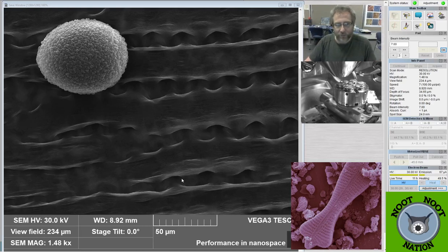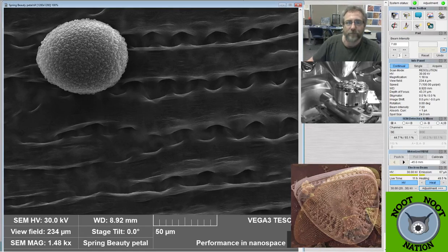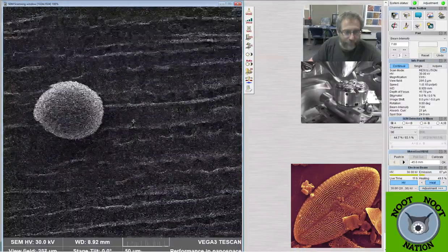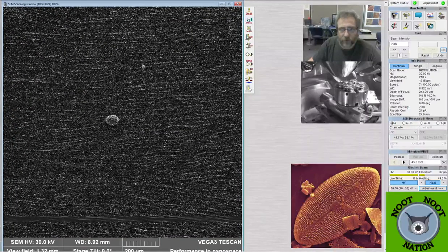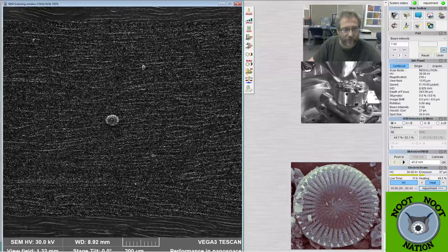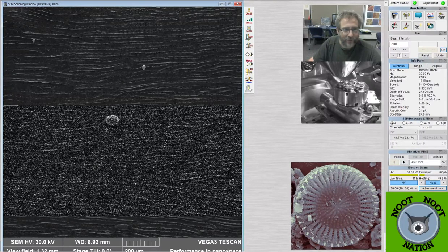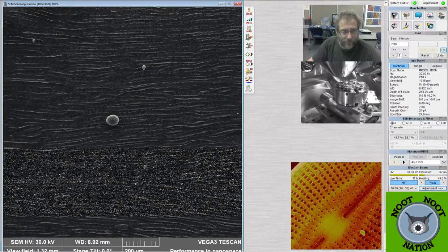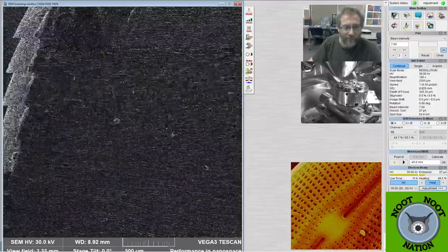And I don't know what this object is right here, actually, to be honest. That's not pollen, I don't think. But this is a Spring Beauty. This is the leaf, a petal of the flower. And we're just looking at the cellular structure a little bit. So if you want to get a better understanding of it, there's the whole leaf. Let's see. Put it on 5, it'll scan a little faster. This crazy structure is the petal, the flower petal. And then there's some pollen right there. I don't know what that object is, as I mentioned. It happens quite a bit when I'm just collecting stuff. We run into things that we don't know what they are.